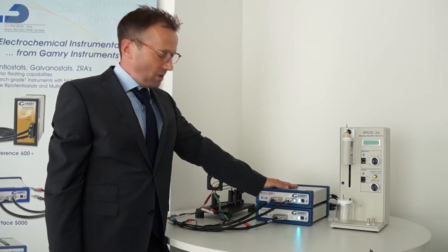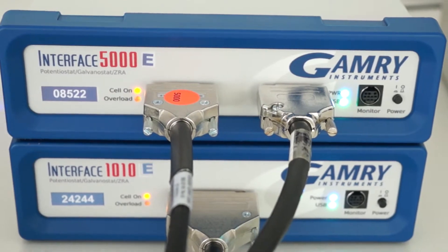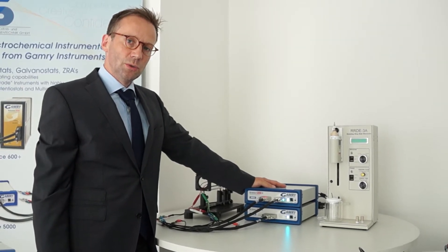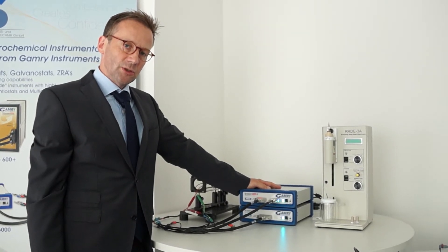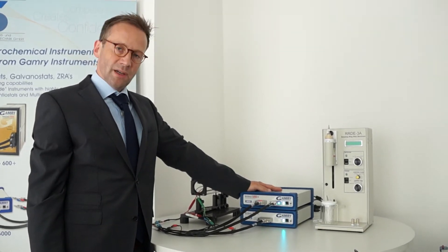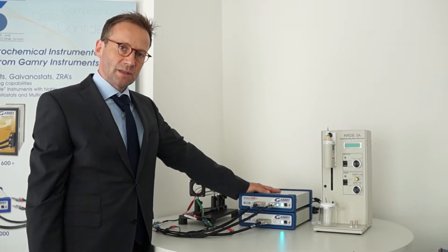Some extra comments about one part of this bipotentiostat setup, which is the Interface 5000. This instrument is somehow special because it has a real dual electrometer, which enables you to run EIS measurements on both half cells of your cell at the same time. And this can either be your battery, a fuel cell, or a cell for your membrane studies.